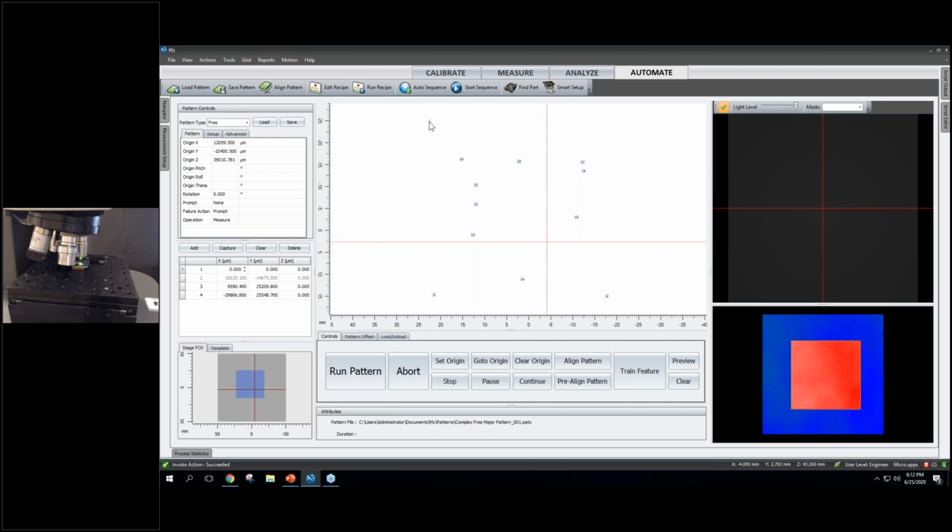Since we're also going to want it to be an alignment site at the same time, I'm going to right click on it, toggle site alignment, and choose pattern align. Now I'm going to do the same for sites 3 and 4. A shortcut to toggle sites inactive or active is to hold down the shift key and then just left click on them. So I'm going to right click on each of those again, go to pattern align.